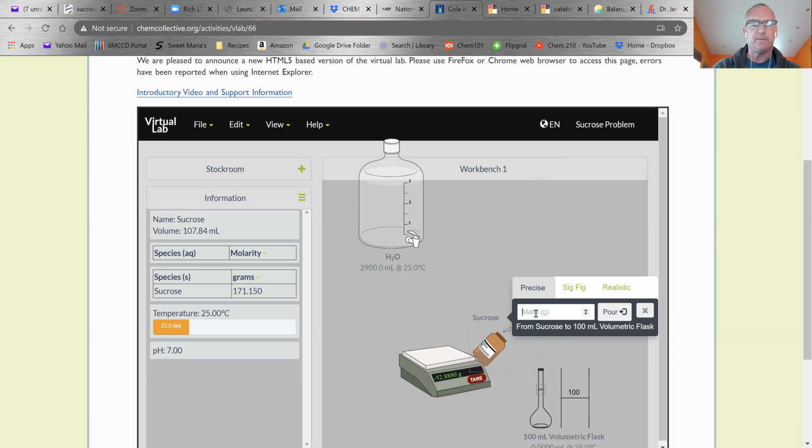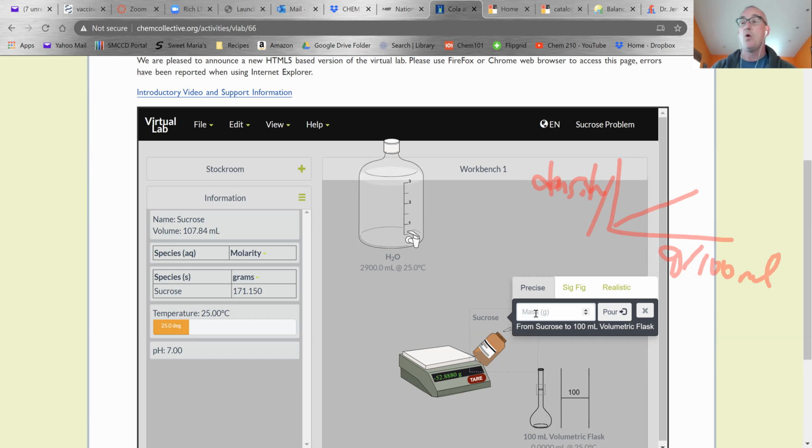One thing about standard curves I want to point out, it's probably a good time to point that out. If I have a standard curve like this, this is my concentration, and this is my density. What if the density of my unknown is out here? Can I just extend that line and figure out what the concentration is? Is that allowed? Can I do that?